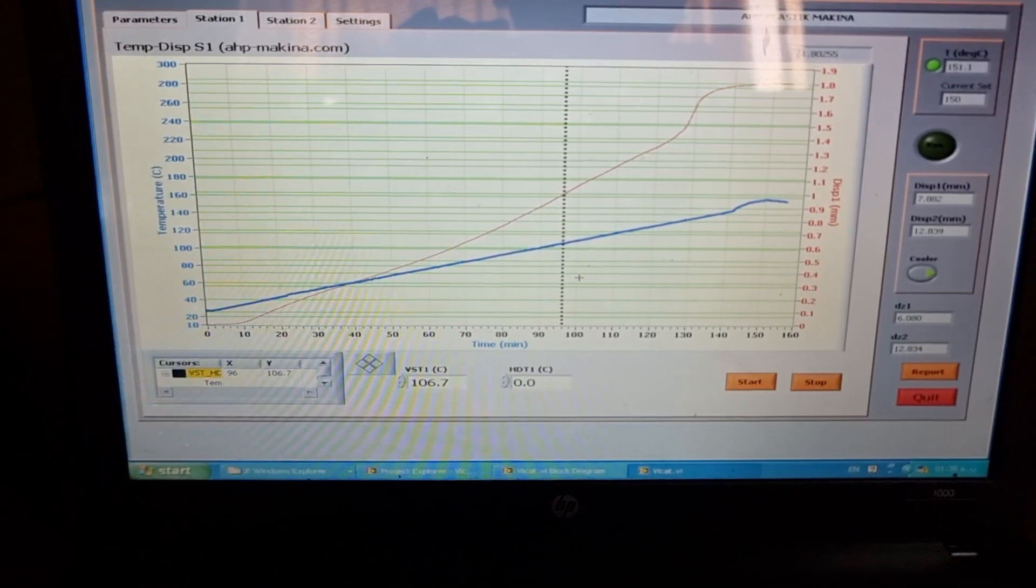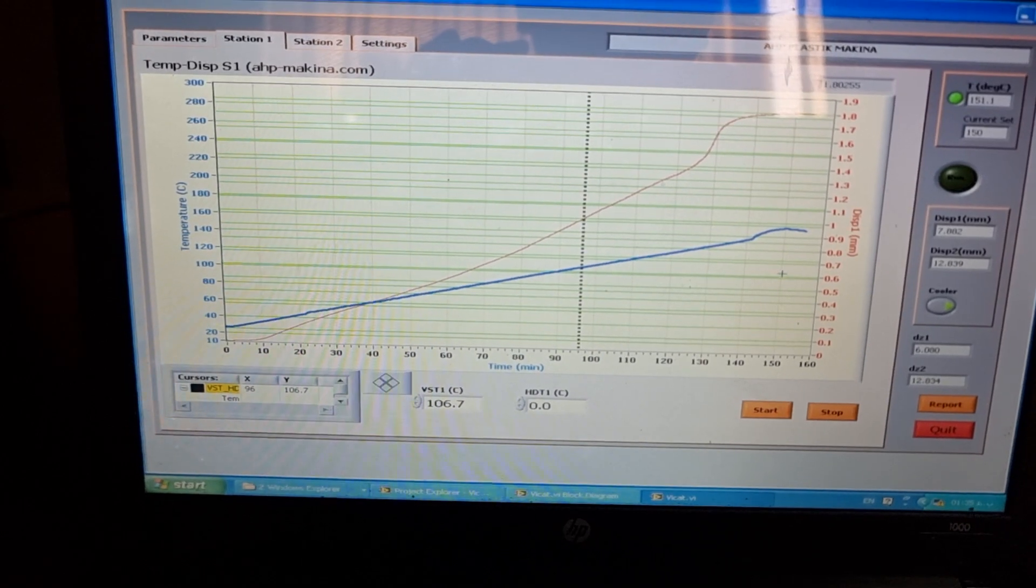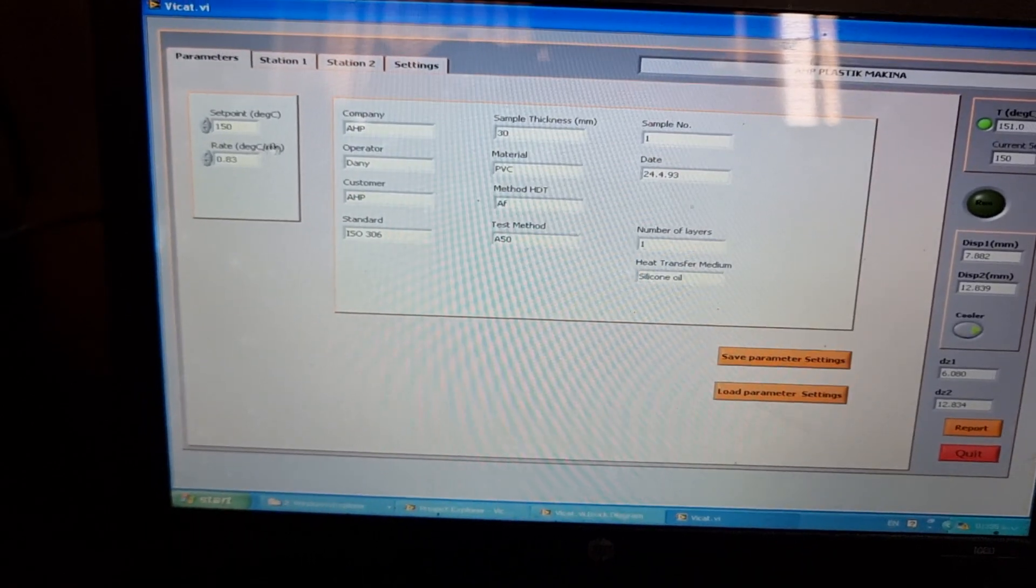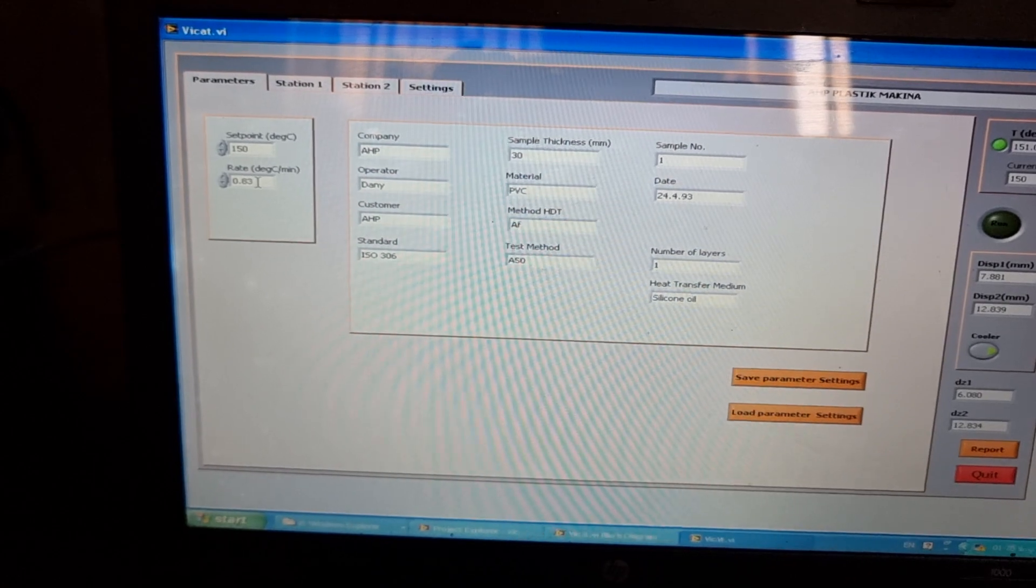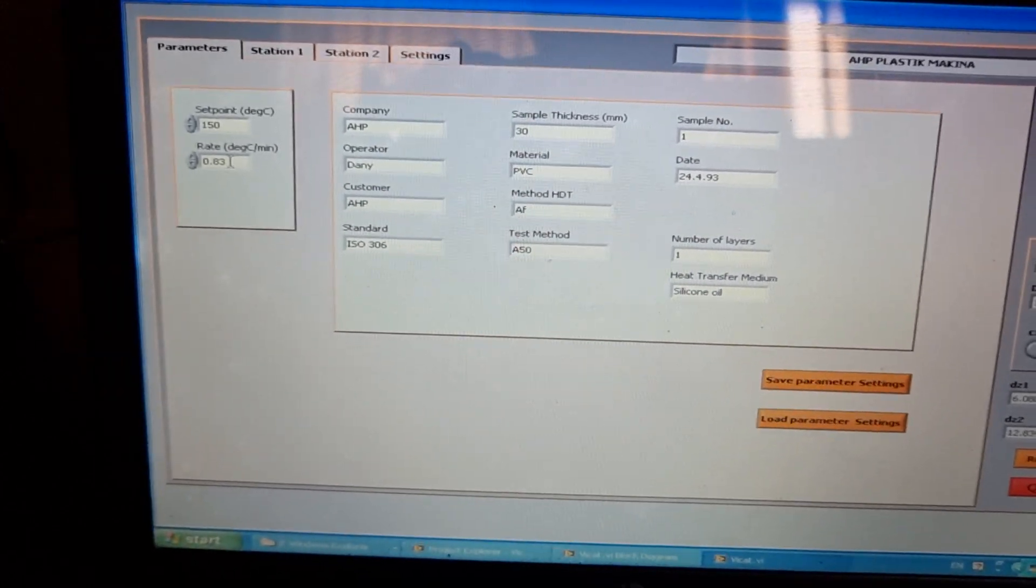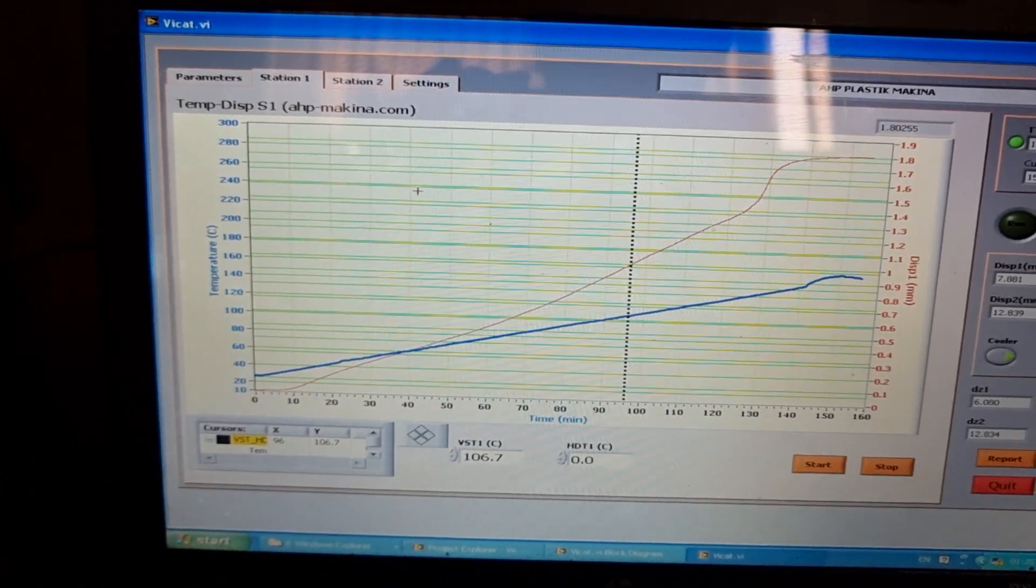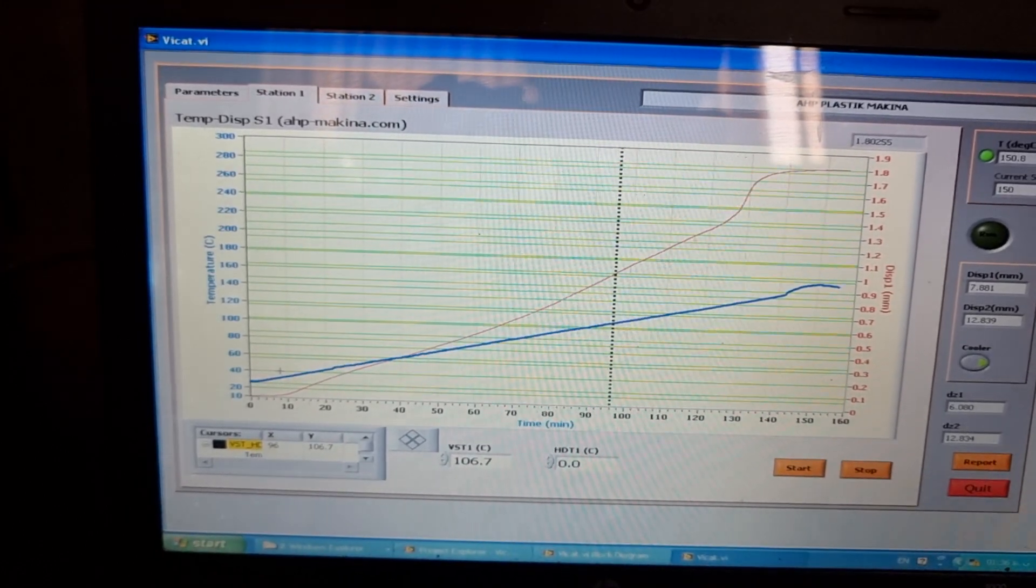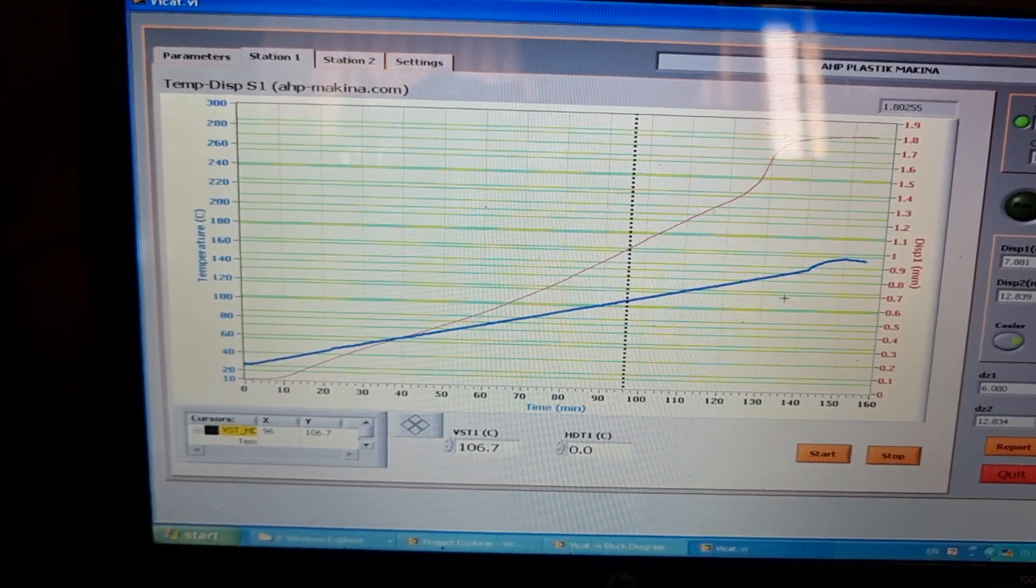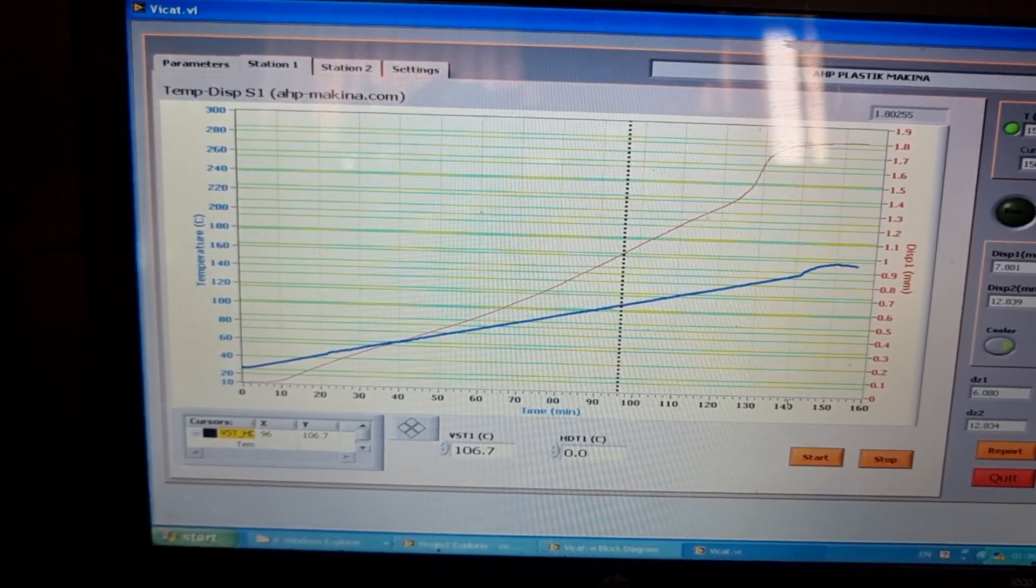At the end of the testing, you will see the graph like this. The set temperature was 150 and the rate is 0.83 degrees per minute or 50 degrees per hour. This is the graph for temperature.